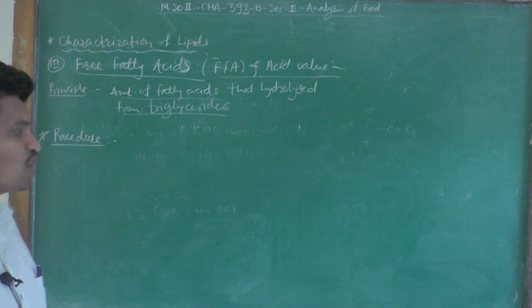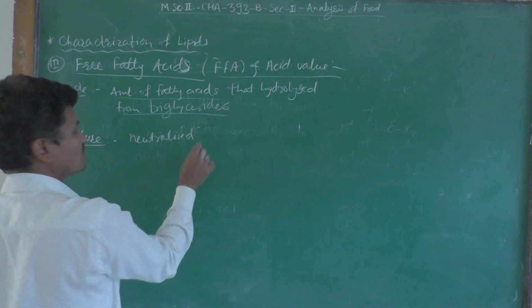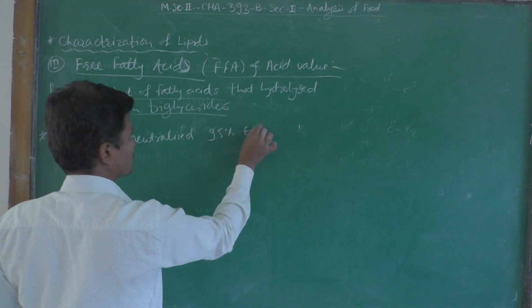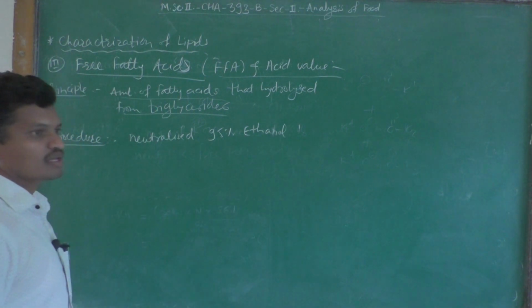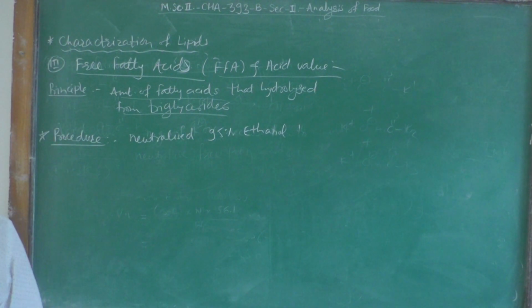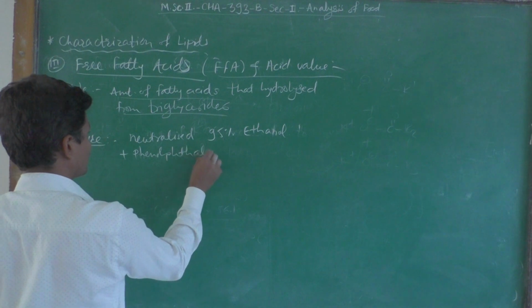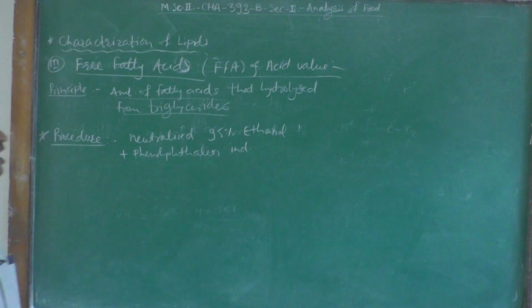Neutralized alcohol, meaning ethanol which is already neutralized, 95% neutralized ethanol, is used, and phenolphthalein indicator is added.